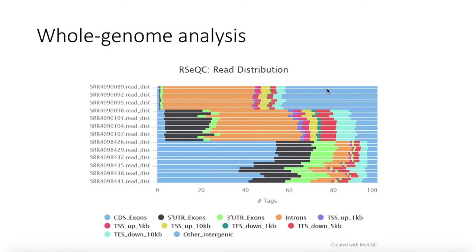So the last thing I want to show you is a better picture of what nascent adds to transcription analysis, right? The top cluster of tracks here is actually ChIP. You can see our nice key down here in the bottom. ChIP is going to bind a lot to intronic regions. It's going to bind other intergenic regions. Not a lot over exons. So this first little strip here, the color resolution may not be fantastic, but the first here is actually exons. Second cluster is nascent.